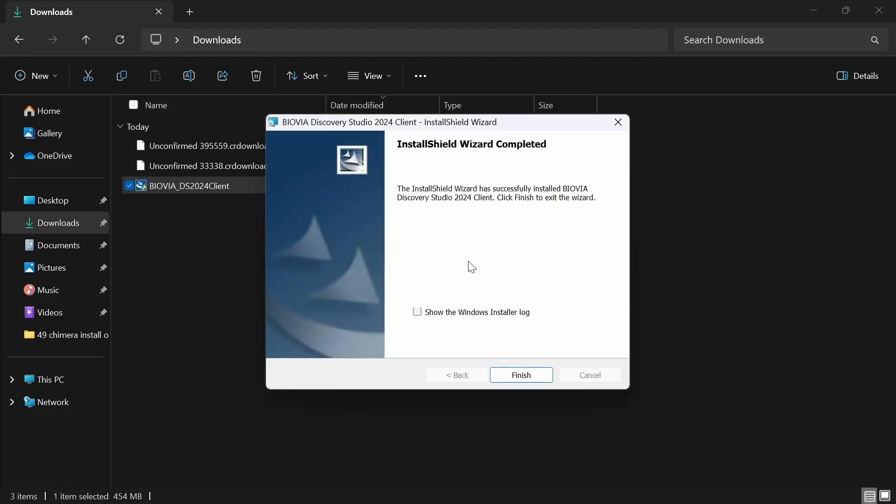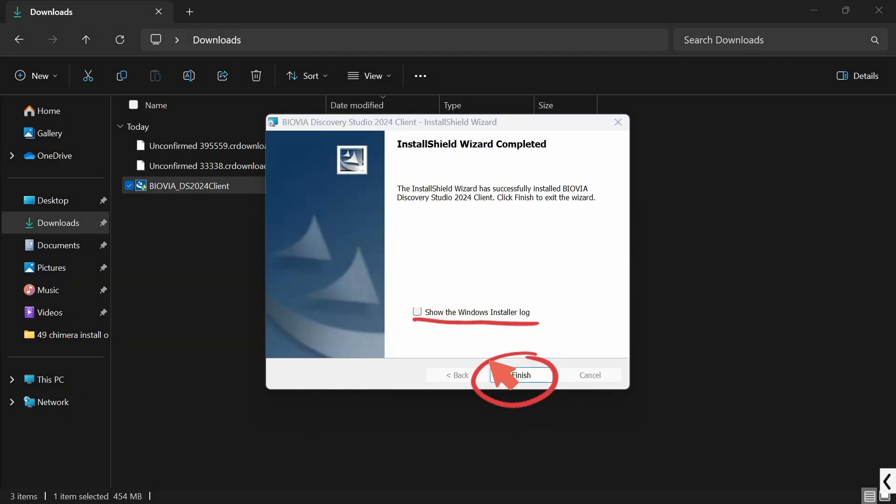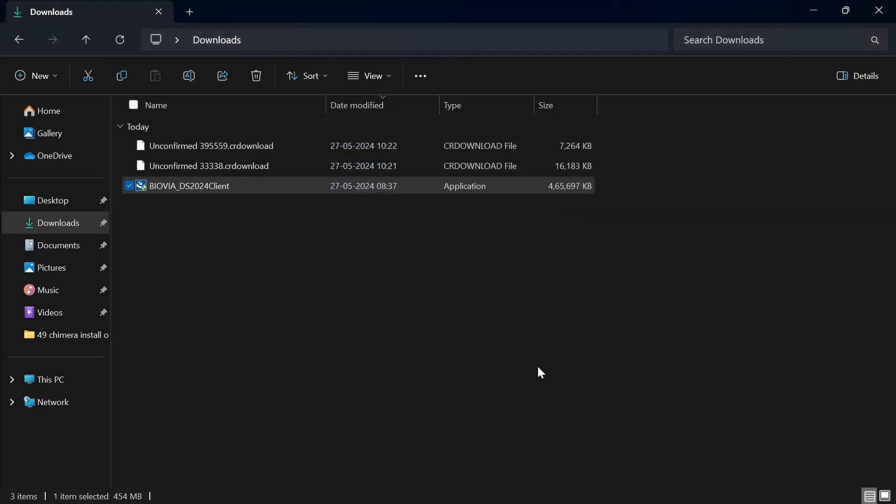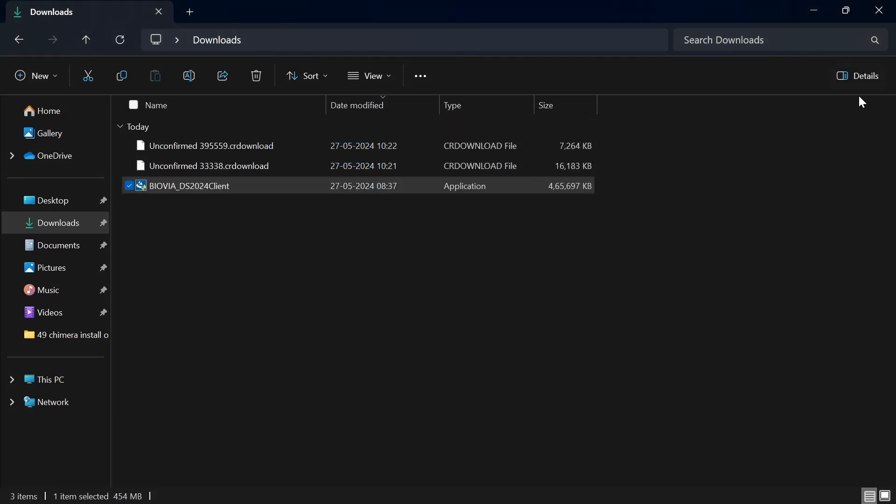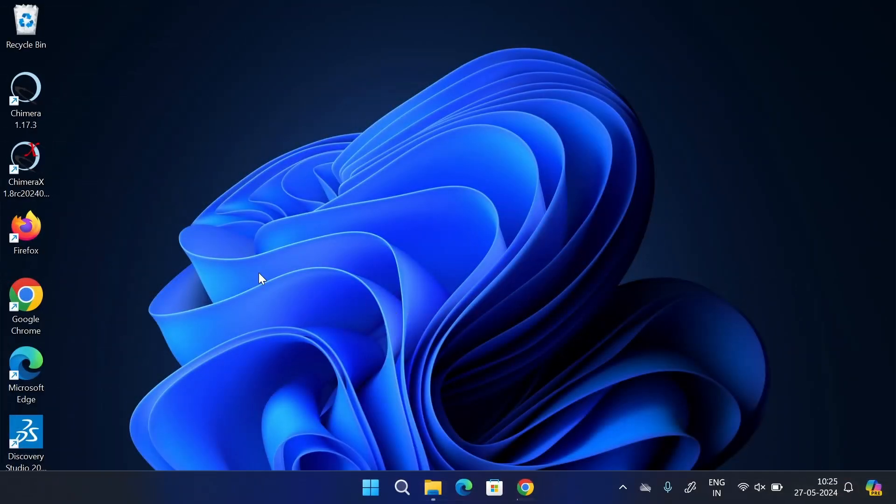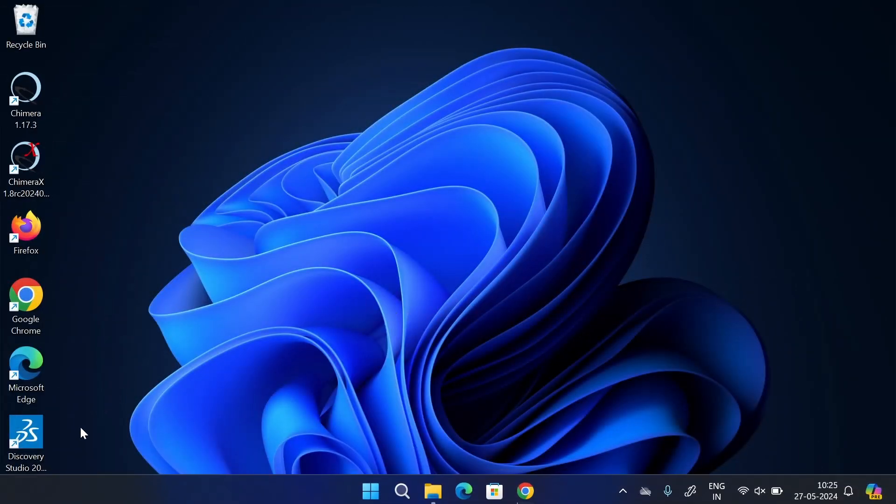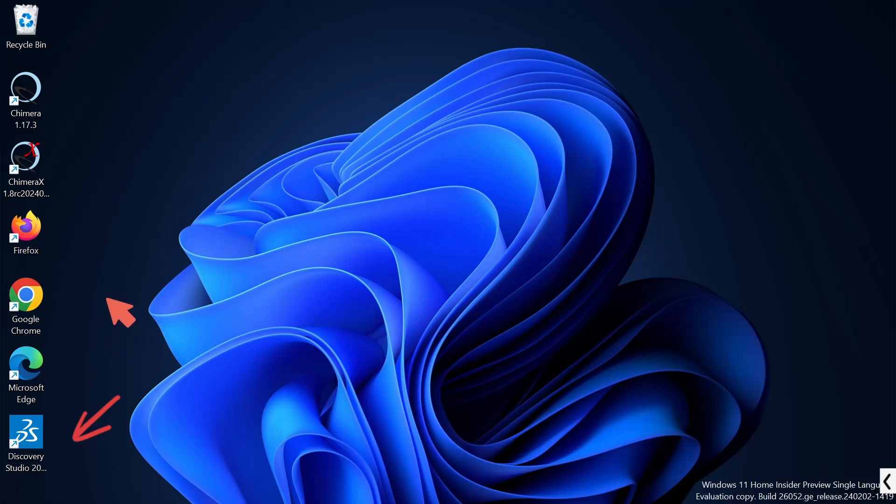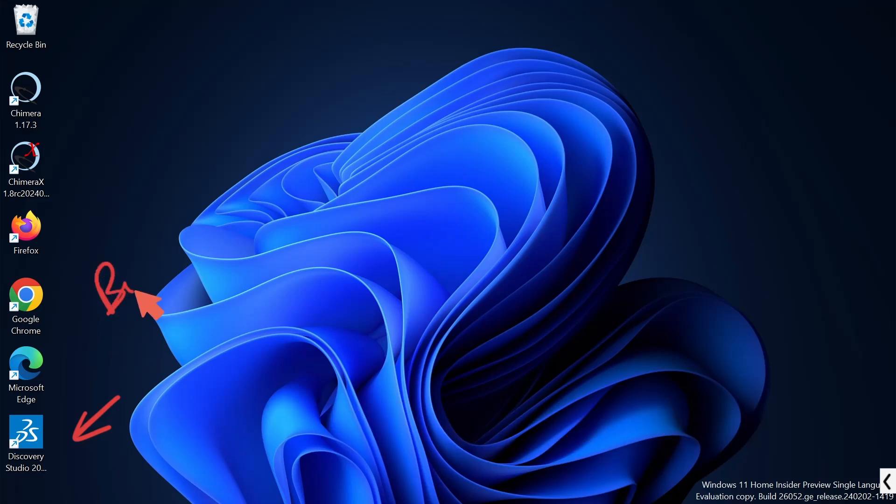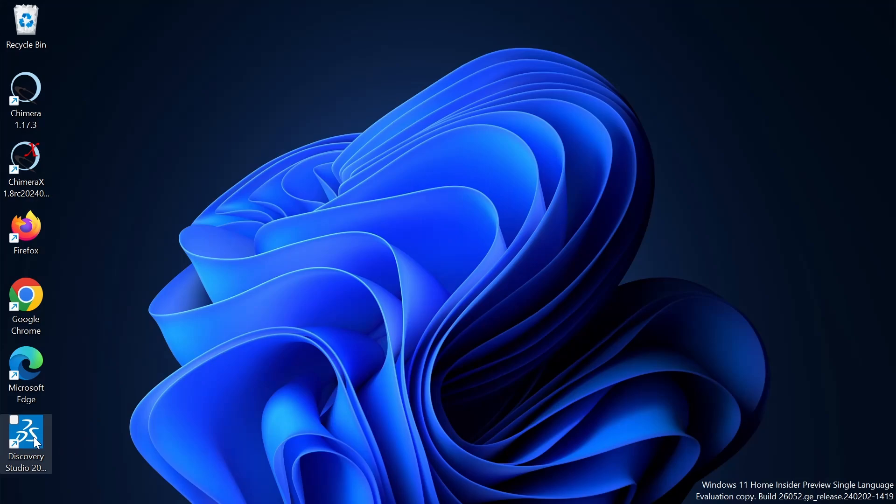After the installation is completed, you will be provided with this dialog box. Just click on finish. So that's all, the installation is completed. Open your desktop. Here, this is the shortcut for your Biovia Discovery Studio Visualizer. Just double click on this shortcut to open the software.